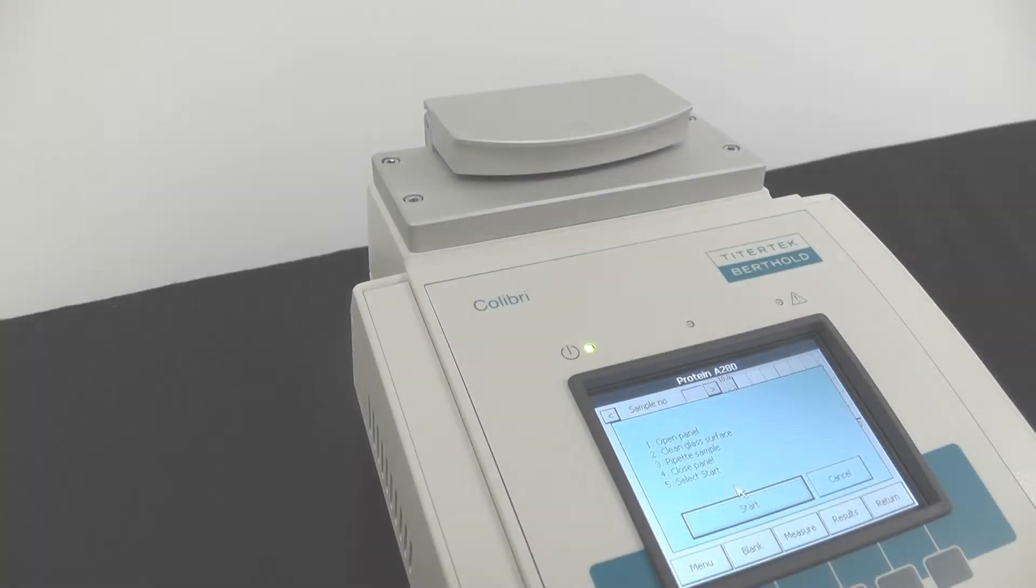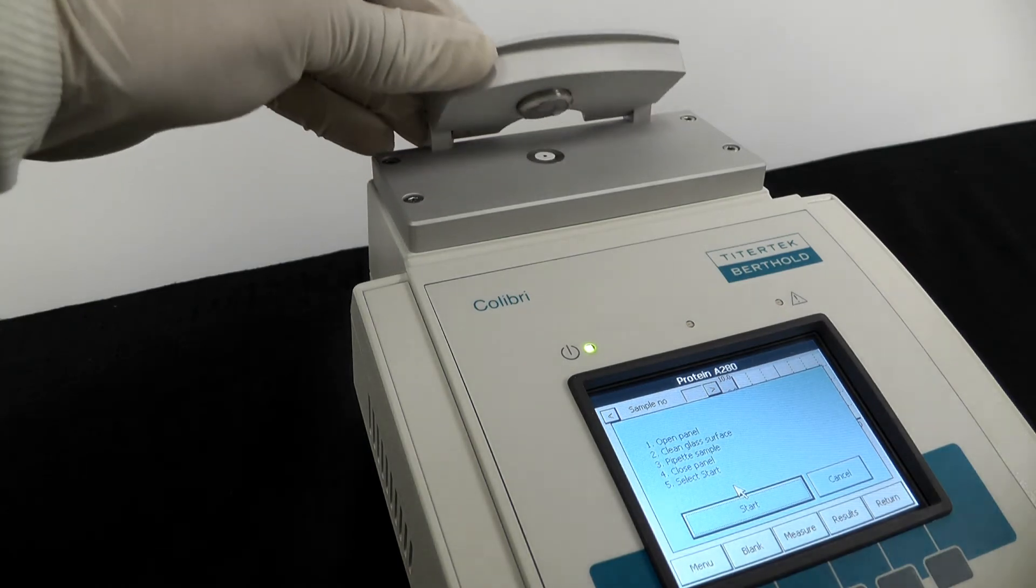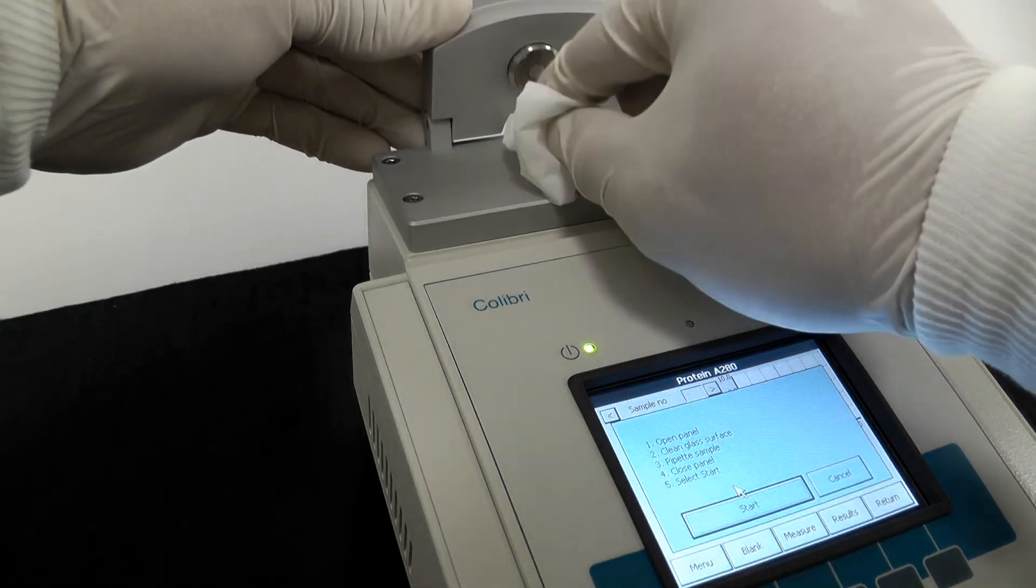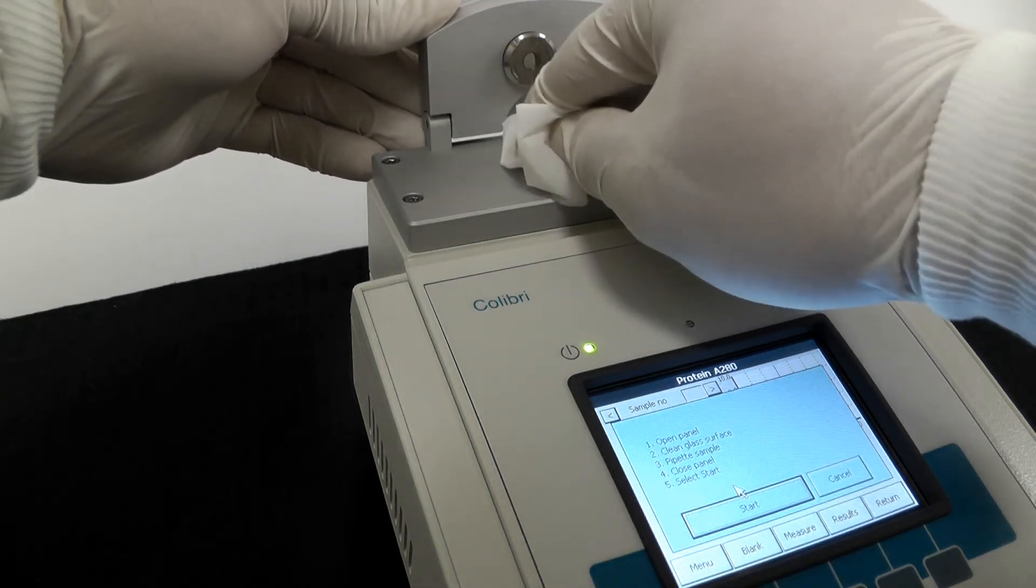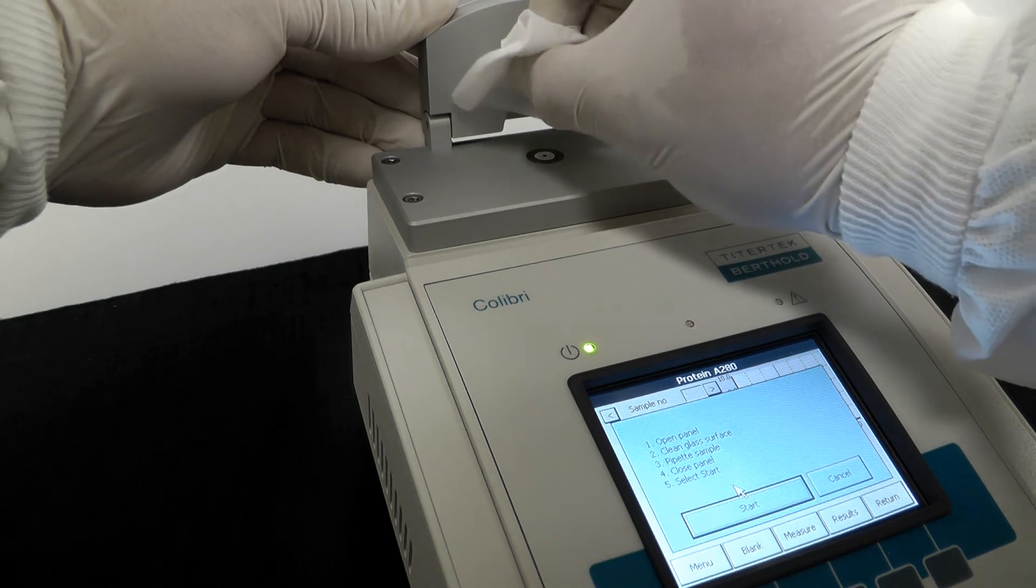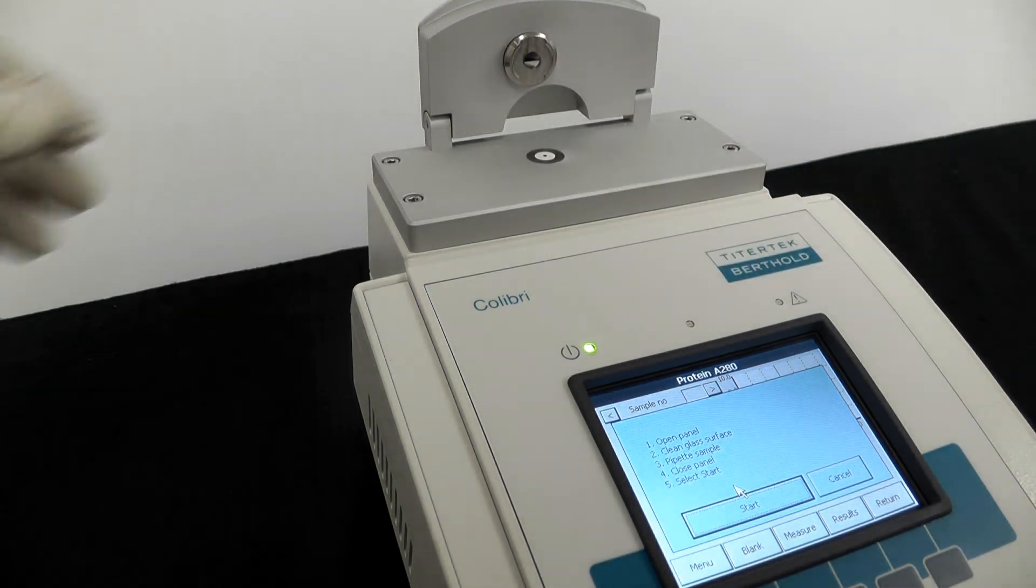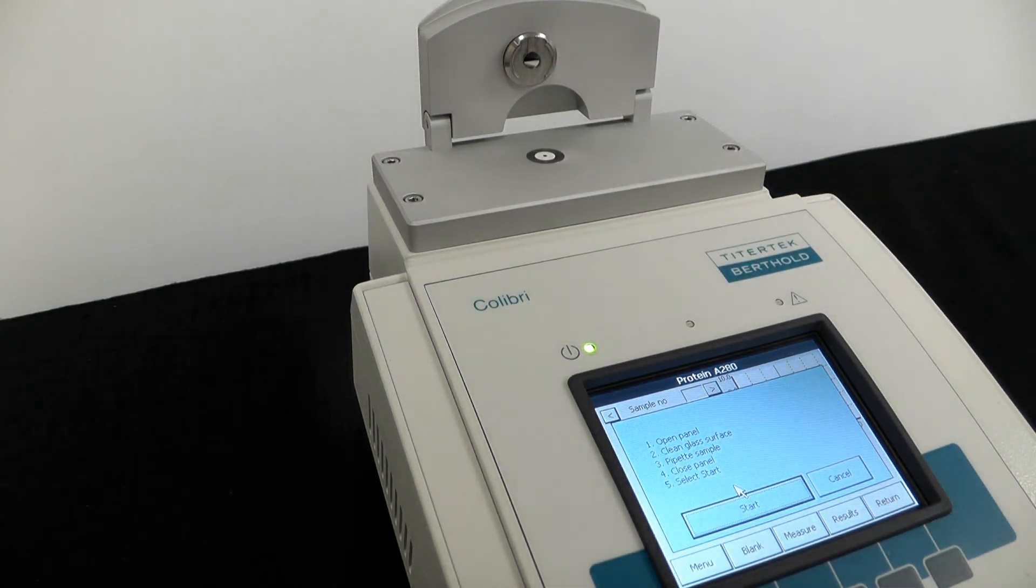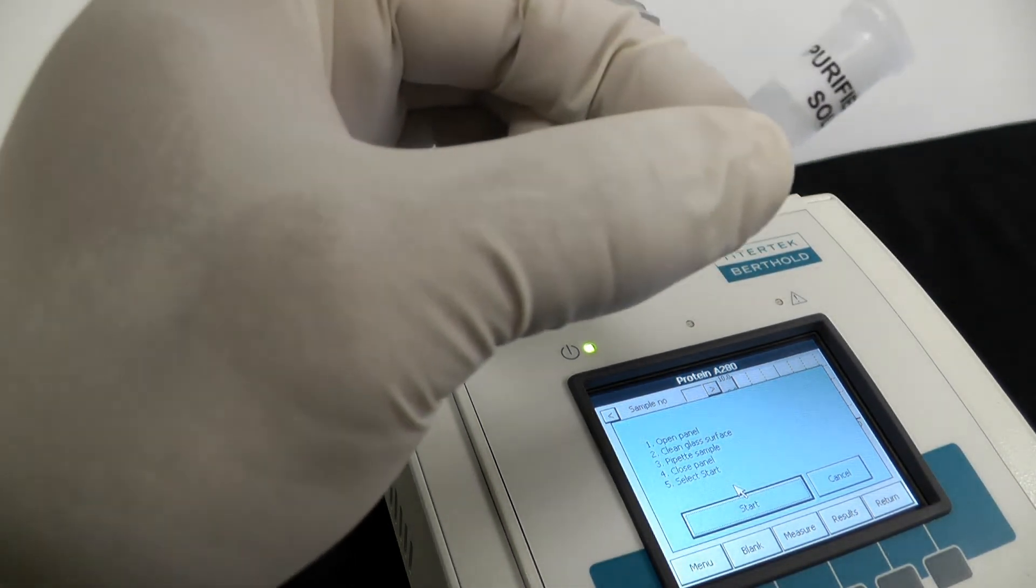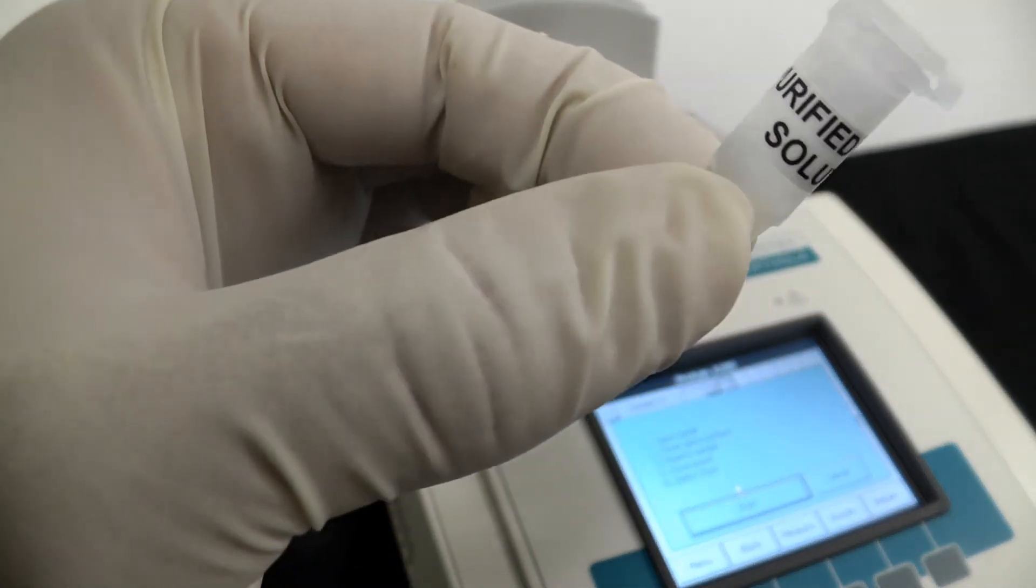Click measure. Open the panel and clean the glass surfaces. Pipet a drop of your protein sample and close the panel.